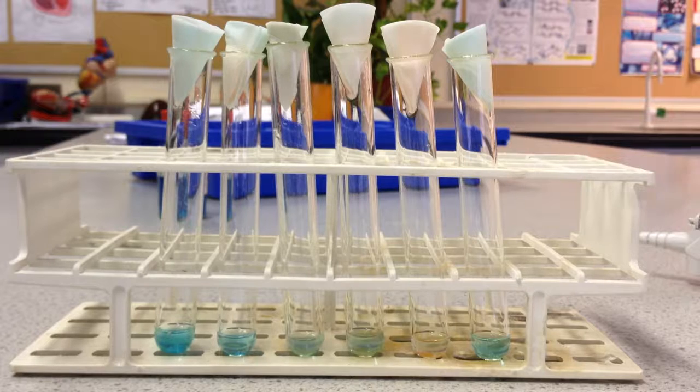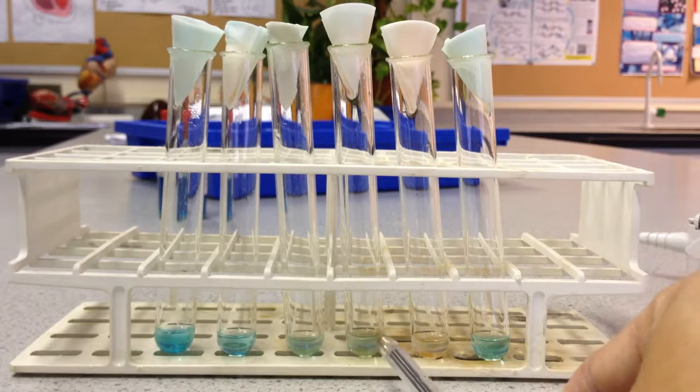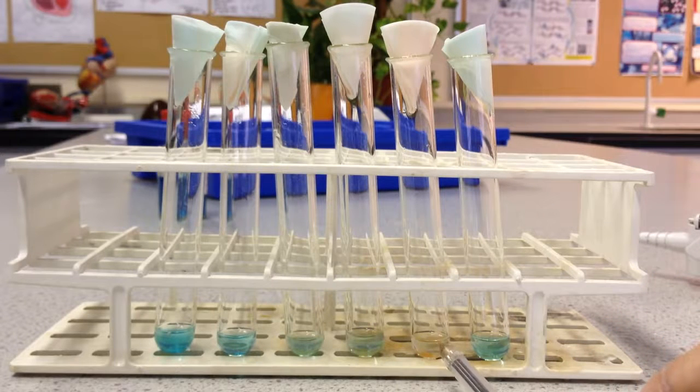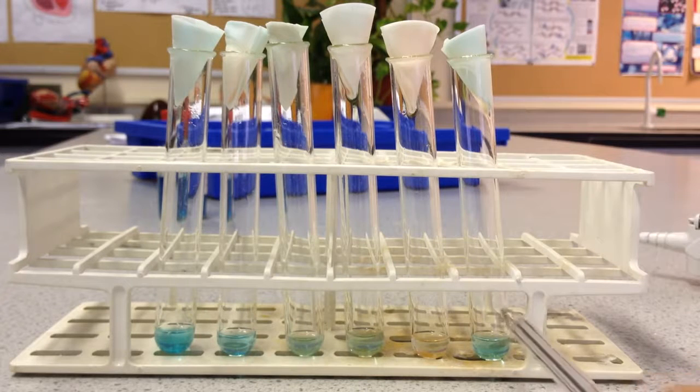And what you should see is that as the concentration of the glucose got higher and higher, more and more of the copper reacted in the standard set of solutions. This one is our test solution, and we're going to compare the color of this solution to the others once we do the colorimetry. So what we then do is to use a colorimeter and measure the absorbance or the transmission of light through that solution. Now what you want to use is a red filter as the solution is blue.